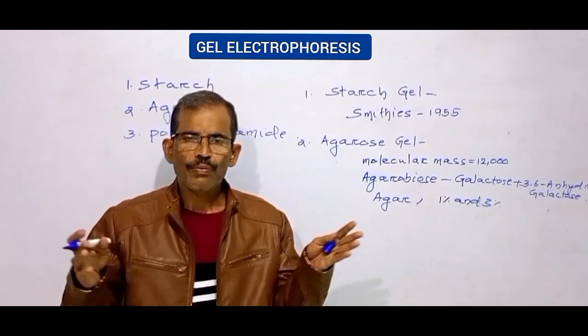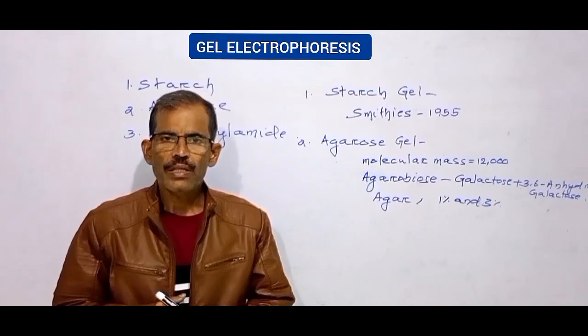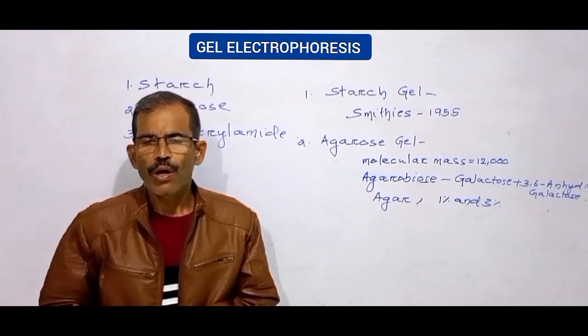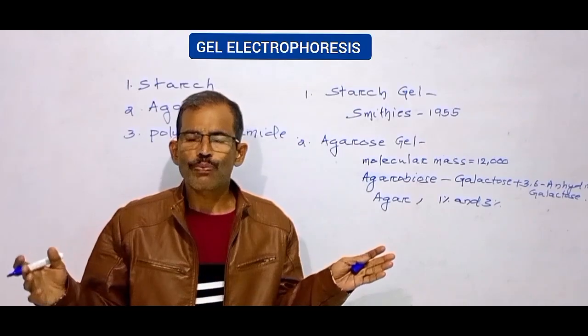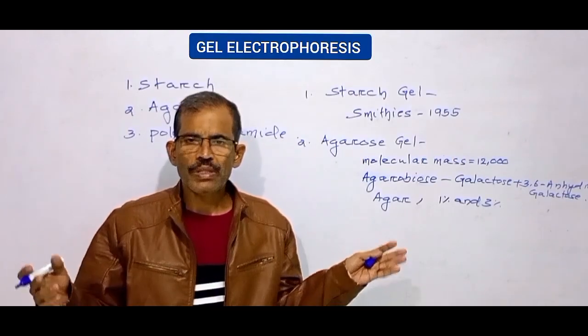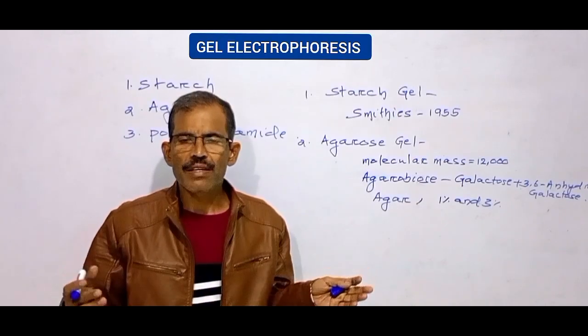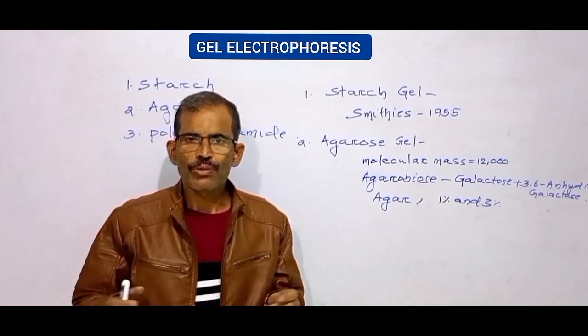Agarose gel electrophoresis is routinely used for the qualitative as well as quantitative characterization of nucleic acids. It can also be used for the preparative purpose as the DNA band can be excised later on and can be purified for further use.